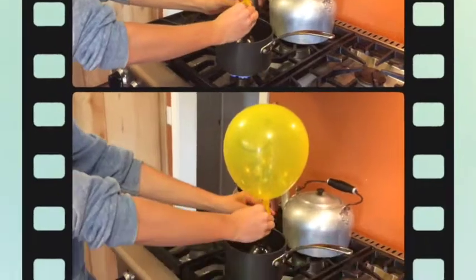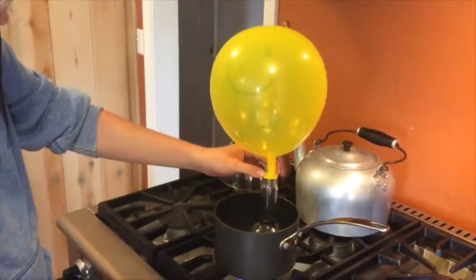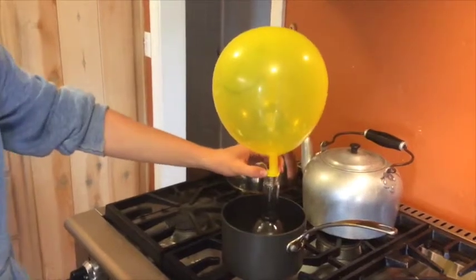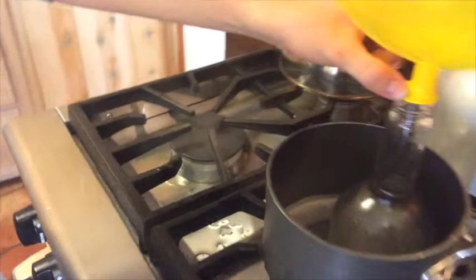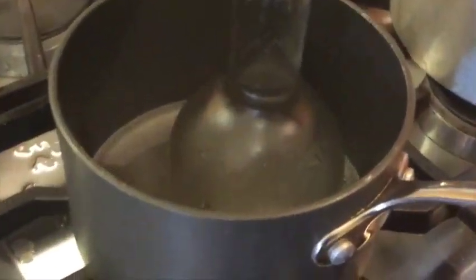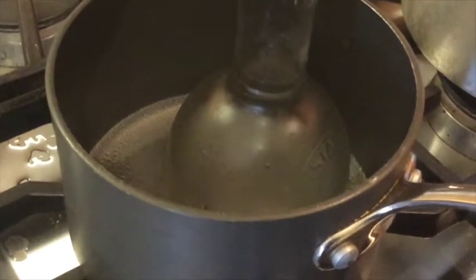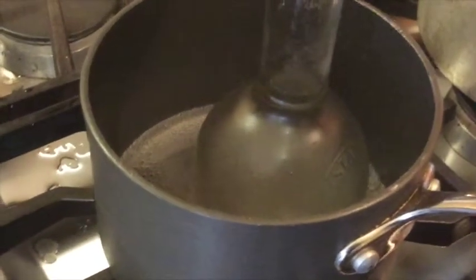The balloon has to be securely on, otherwise it will fly off. What's supposed to happen is it's supposed to get bigger. Zoom in right here, you can see the vapor inside from the air pressure. You can see the water itself is starting to bubble, so you know you're at boiling point. There's some condensation, you can see it.